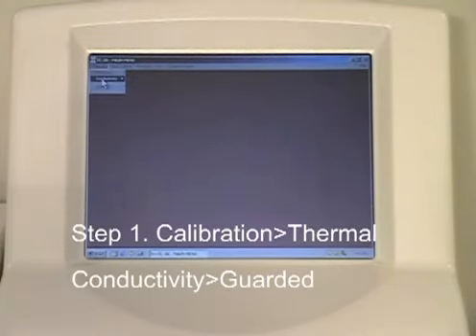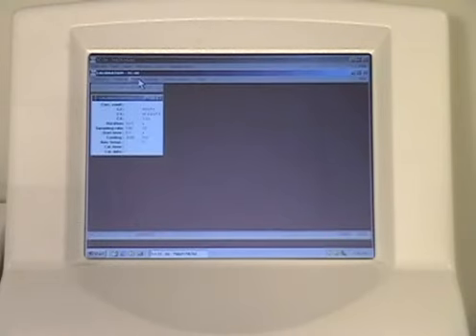Step 1. Select from the calibration menu the Thermal Conductivity Guarded option.